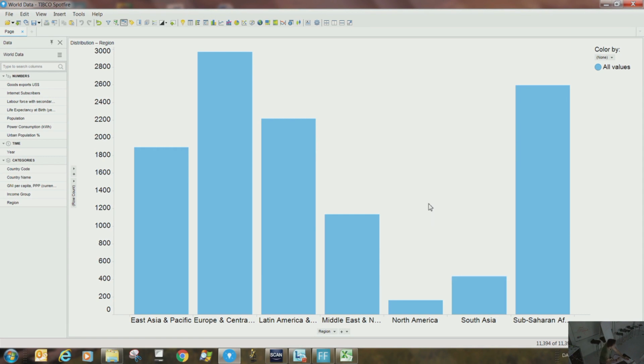And also there is no data limit. If you have a big file, it also supports big data. But I think in biology, I haven't seen any data like that. But maybe in STEM, right? If you have many embryos, many cells, and time-lapse data, then it might go to gigabytes. And I have one example for the siRNA screening for that. So data size is not a limit.